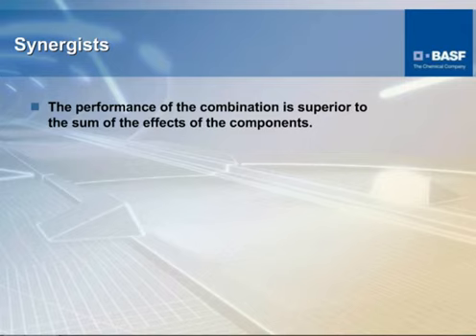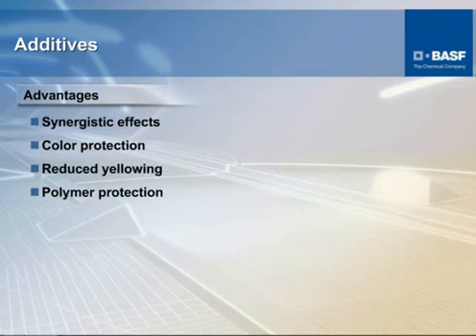And hitting upon that proper combination to acquire your desired results is what R&D is all about. There's a lot of combinations out there, and they perform differently depending upon the polymers involved. Now, here are the advantages and disadvantages, of course, of the organic. We touched on them slightly.